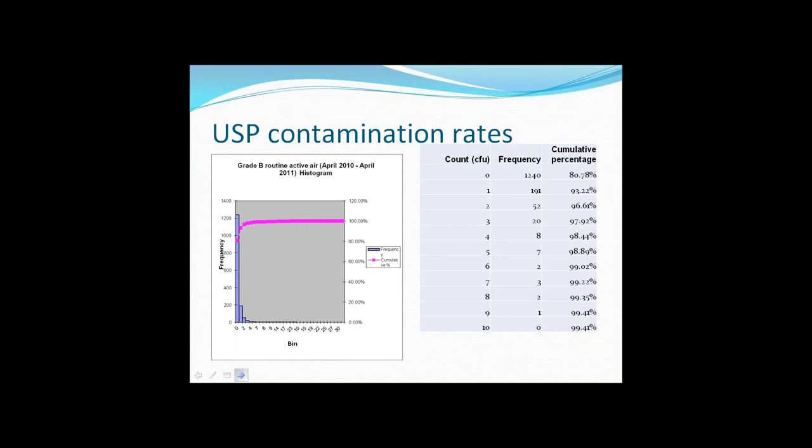Is this a problem? If you analyse the data further, looking at the counts, if you were to take the EU GMP recommended action level, which, as these are air samplers, is 10 CFU per cubic metre, then only 0.6% of the samples exceeded that value. So from an EU GMP Annex 1 perspective, this set of data, with a couple of samples over action, might trigger an investigation, but overall is not too bad. From the USP perspective, it could infer an area that's out of control.